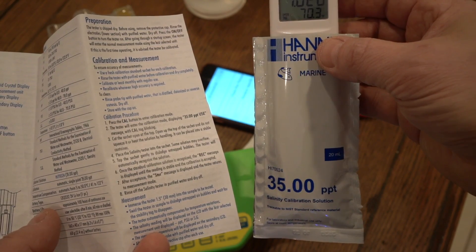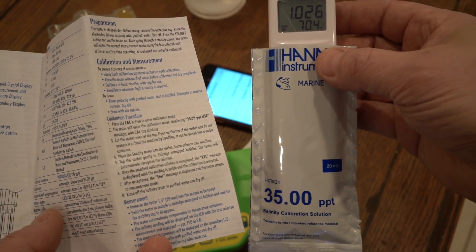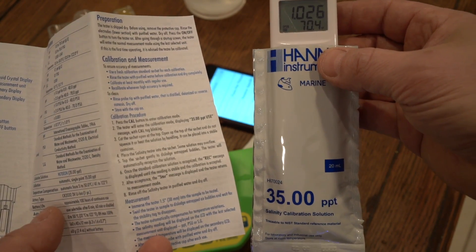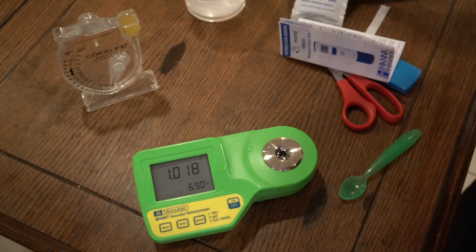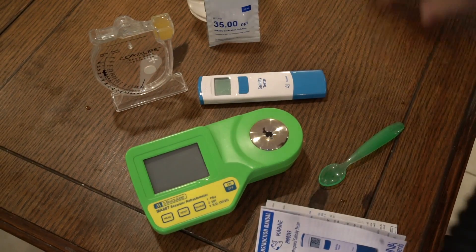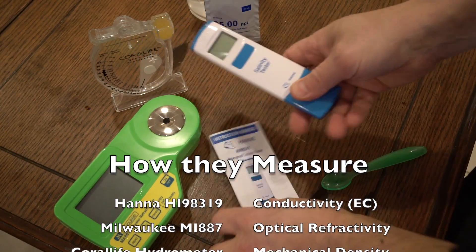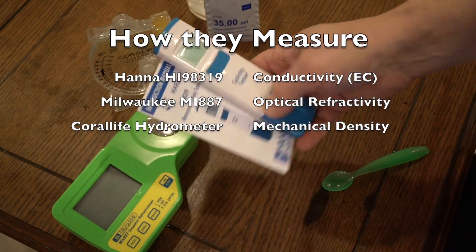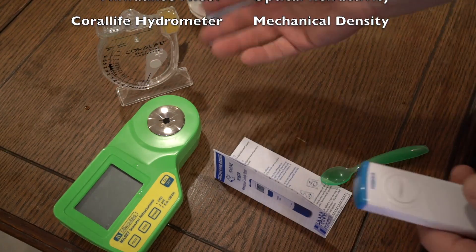Quick and easy to calibrate. So let's check the calibration fluid in the Milwaukee — let's see what it does. I checked it again with the meter and the fluid has to be calibrated for those electrodes and not optically. So let's just go over the three methods that we use: conductivity, optical refractivity, and mechanical density — three different ways that all of these measured the same thing: salinity.